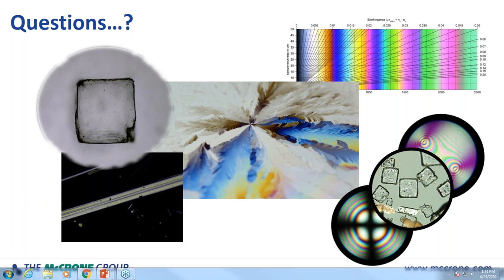Any good digital microscope is going to give you a pretty good image of what you're seeing through the eyepieces. Some of the issues you're going to run into with those digital cameras is that you can get them to compensate themselves, in other words, adjust themselves for contrast, intensity, and so on. As you go back and forth between bright field and polarized light, that may create problems for you as it tries to dance back and forth to adjust the image itself. Easy fix for that, just turn off the auto adjustment or the auto compensation. But that can be done.